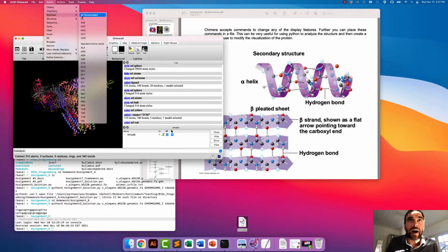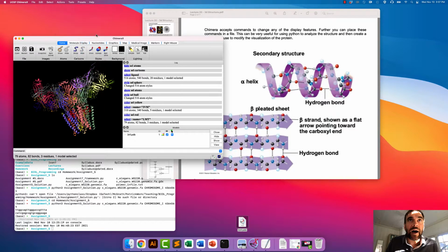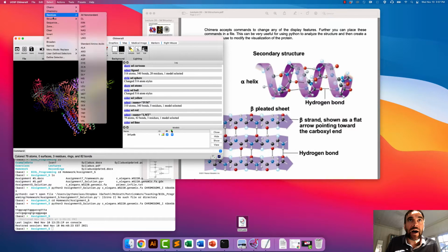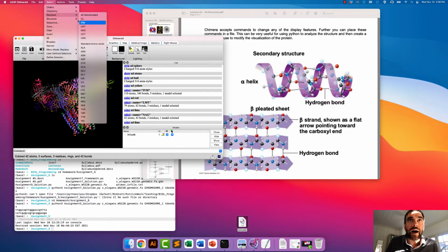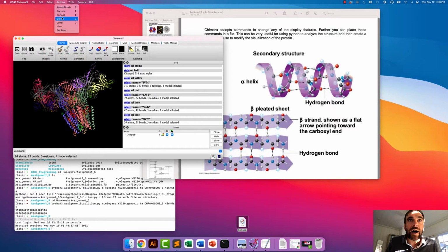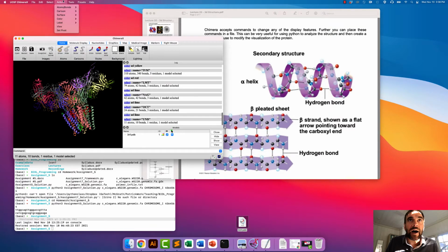And we will also, let's change these to, let's say, lime green. So I'm just going through and selecting some of these other fatty acids and making them all the same color, and this will help me see.